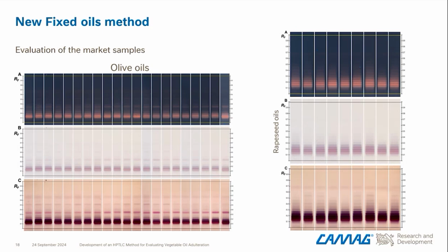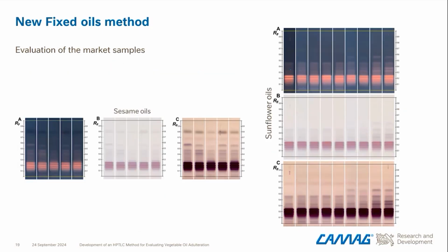Same result for the rapeseed oil. So you see that all the fingerprints are similar. We have done the same with some sesame oils and with sunflower oils. You see that with the sunflower oils, we have a bit more difference, but it's still accepted as sunflower oil.